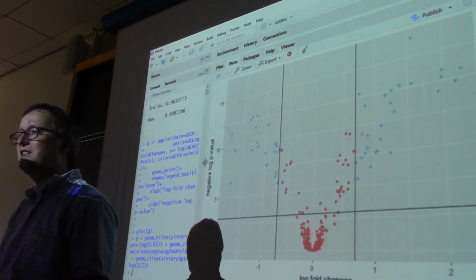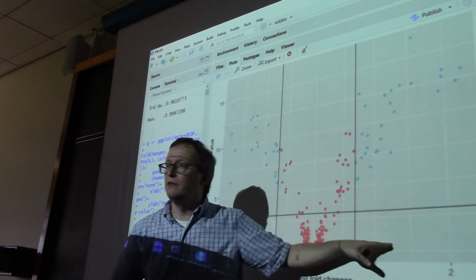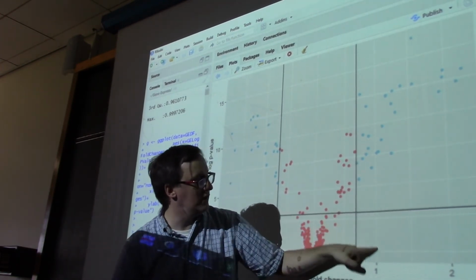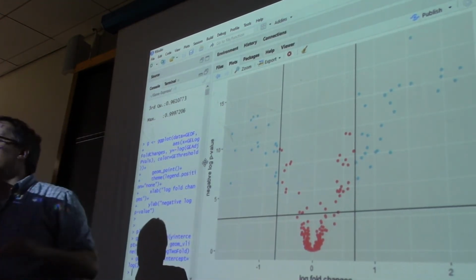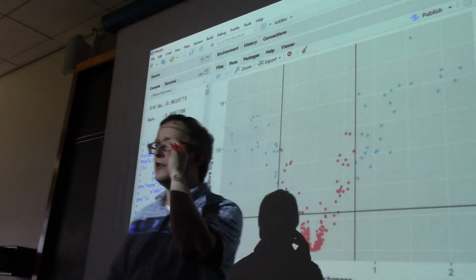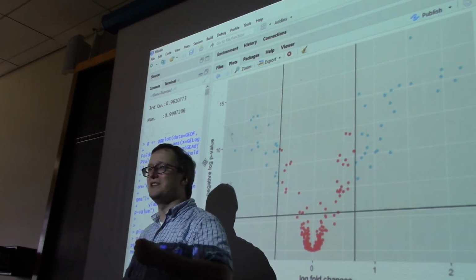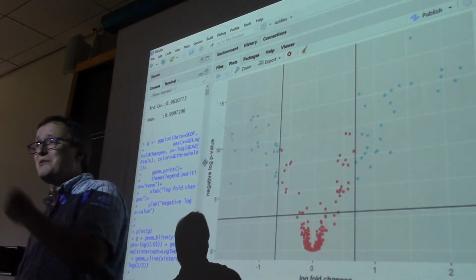But the structures that we use for visualizing these data are always worth thinking about. In this case, we note that there's no grid, really, to be seen, especially in the base graphics. But if you look at it carefully, you see that this is a light gray square bounded by a white grid box. So it's already giving us a little bit of indication where the units fall on the vertical axis and on the horizontal axis. So these are nice features, and there are so many people working in the space of scientific visualization on the ggplot2 project that using it probably means that you're going to gain from their insights on what makes a good graph and what makes a bad graph. Does that answer the question?